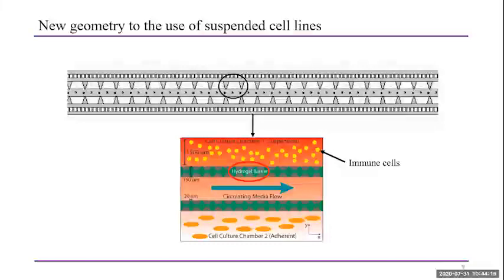So we needed to make the parts taller and wider because with the sizes that we had, there were a lot of problems, like the surface tension problems that arose. And so with those hydrogel barriers, we're hoping that it will cause a good gradient. And so our circulating media flow can work and give us good results.